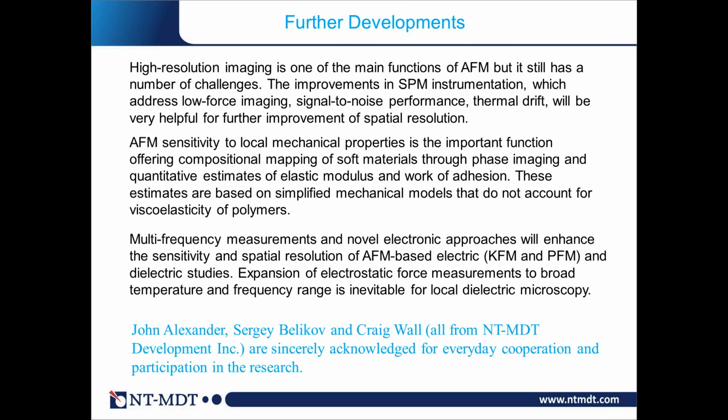Okay, we have one last question from the audience, and then we're going to need to wrap up as we're about 20 minutes over time. The last question is, what's the best way to characterize the spring constant of the probe?